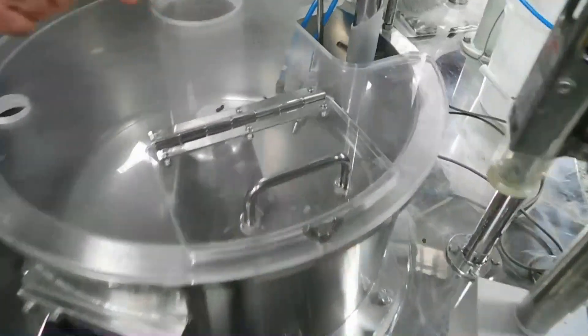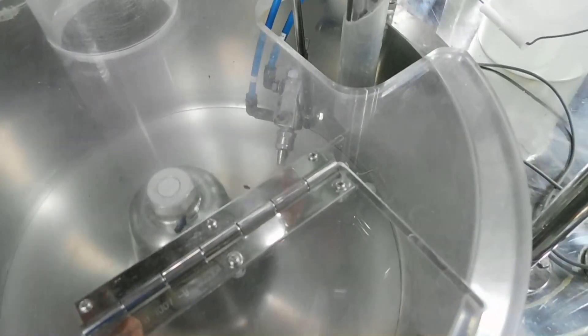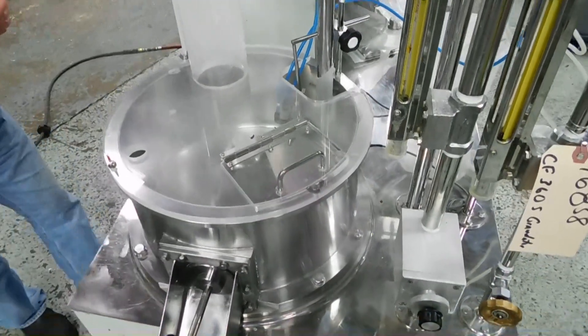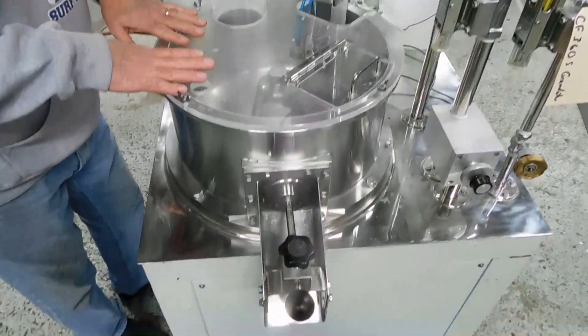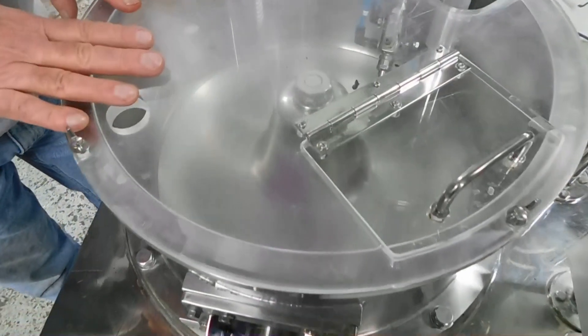You'll see the spray here and here. It's got a lot of different adjustments for position and whatnot. Your air lines, and we don't have our liquid lines connected right now. The heat comes from the bottom of the rotating disc, and we're going to show you that in a minute.